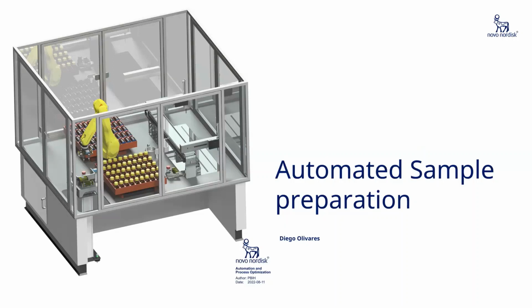Over the last year we have been working on automating the sample preparation for solid samples, for tablets and powders, in our CMC area. The work cell that you see on the left side is a machine that we built ourselves, everything. Since we have control of the whole project, we had the opportunity to create something with very nice data flows and how the data looks, and so on.